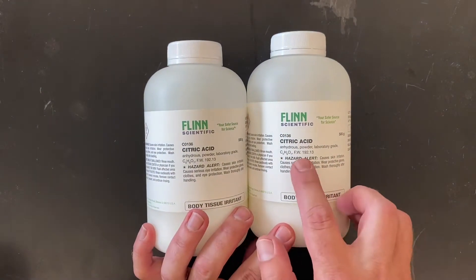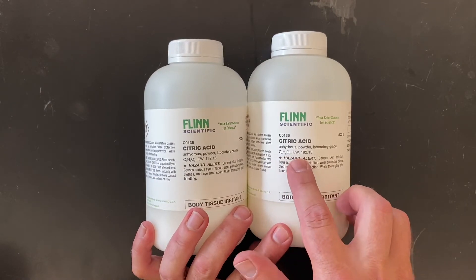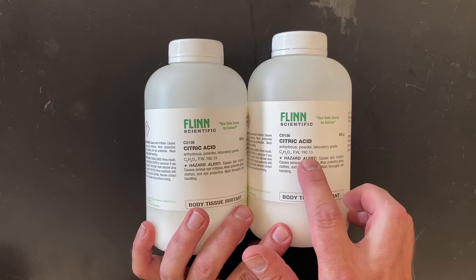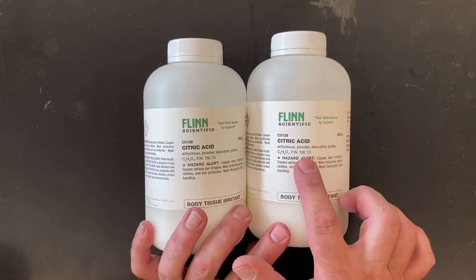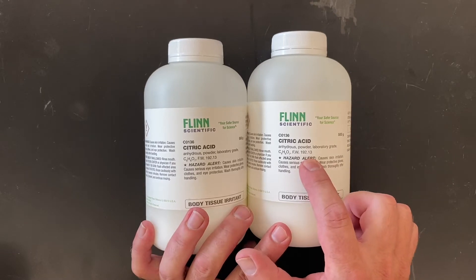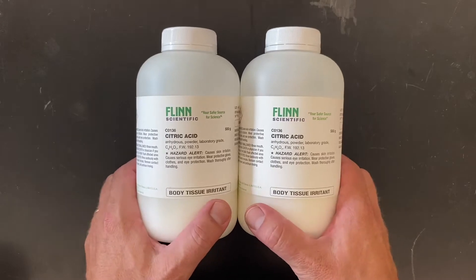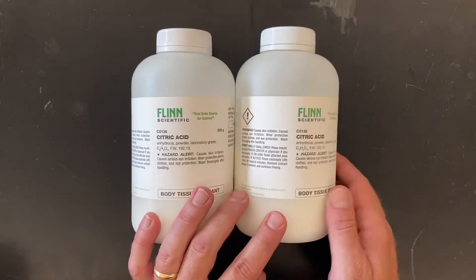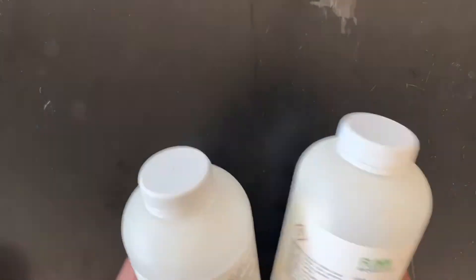Quick pro tip: there's the formula of citric acid and right next to it on the bottle they put the molecular weight or formula weight — sometimes called the molar mass. It's usually right on the bottle, so it saves you a lot of time calculating. There are also hazard alerts on the side — you always want to read those.